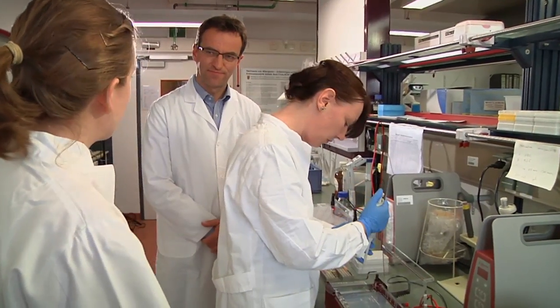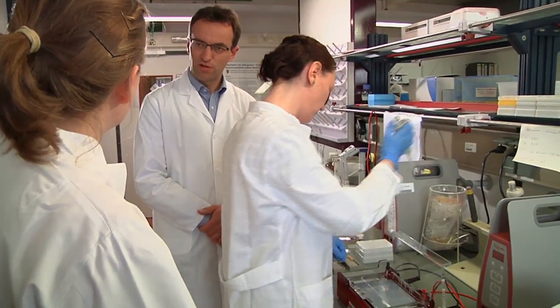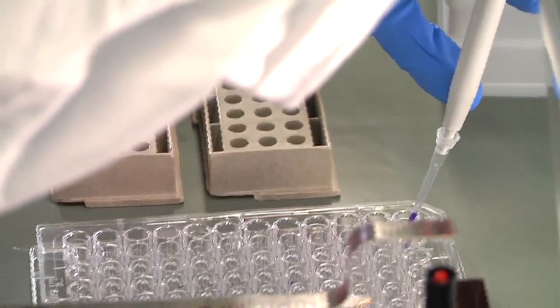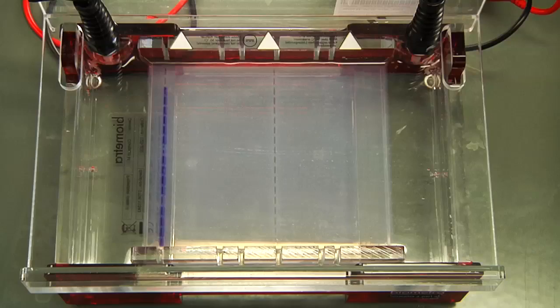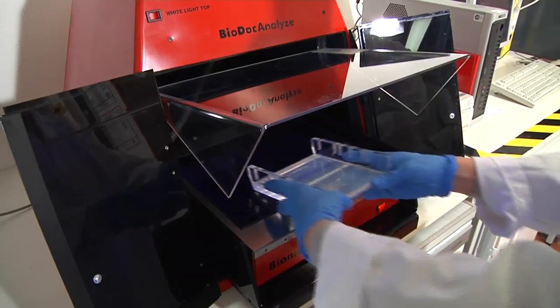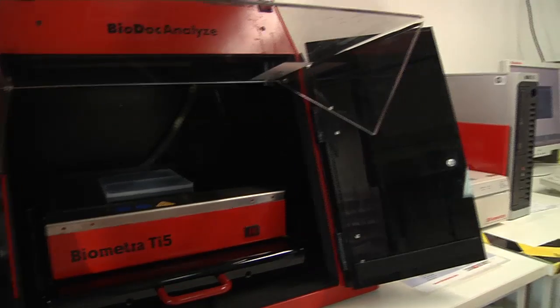How is it possible to see now whether my maize chips actually contained any genetically modified DNA? If they did contain genetically modified DNA, we'd expect that the PCR reaction would produce a fragment of a specific size. In the gel electrophoresis here, we're able to separate DNA fragments very sensitively according to their size and make them visible. These fragments move through a gel in an electric field, and small fragments move faster through the pores of the gel than longer fragments. On the picture of the gel, we can now see it clearly — our sample really does contain genetically modified maize.